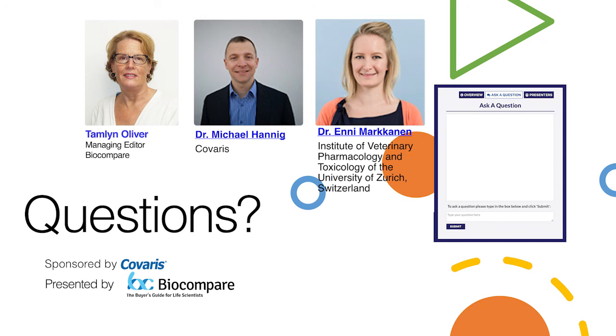Actually, if you're using human samples, it's a bit easier from the point of view that if you get your RNA sequencing results, you obviously have much better databases to align your sequencing results to. So you get even better data out of it when you're using human or probably also mouse samples, which we have done as well. True. So yes, the dog brings in an additional complication in terms of the databases, the genome annotation and everything not being so ideal as for human samples, for instance.